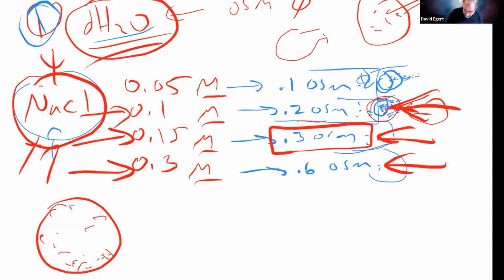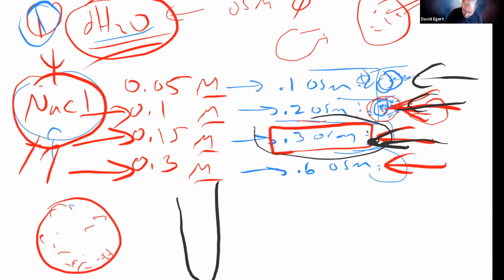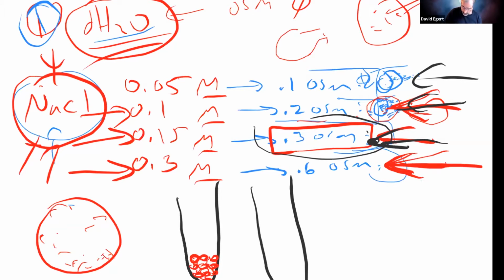And again, sometimes, especially when you can compare, if we have a tube where we know the cells are probably isotonic, meaning they're not shriveling or exploding, then I can compare. Let's say there were 10 cells in here, and then I had crenation, they shriveled up, and I had 10 cells.